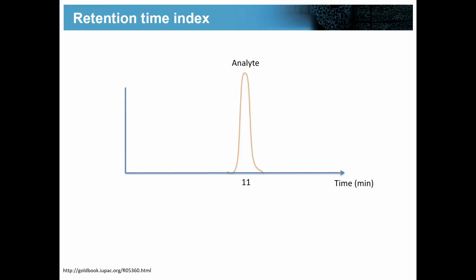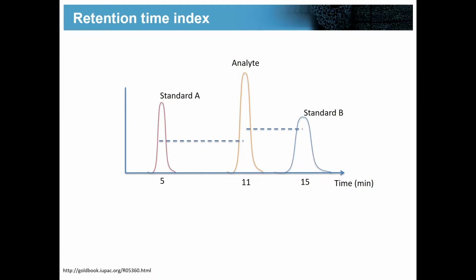So actually, there was a question already after the first lecture. I said we're using the chromatographic behavior of the peptides as prior knowledge to do later DIA analysis, but what if we're using a different chromatography system or a different column or whatsoever? And so what we're using here is the idea of a retention time index. So if this is the analyte you're interested in, what we do is we spike a bunch of standards into the sample. So in this case, it's 11. The set we use is these IRT peptides from Biognosys. This is 11 peptides, which we spike into all the samples.